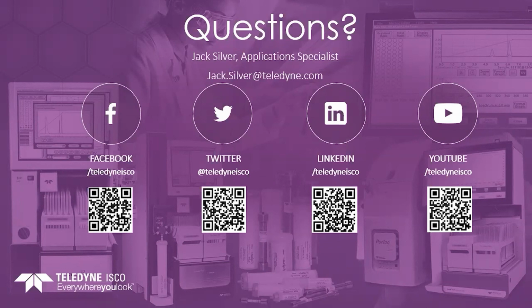Another question, and I thank you for keeping them coming in, is what is the minimum amount of sample that you can run on a scouting gradient on the focus gradient generator? Usually for a 20 by 150 millimeter column, I tend to run about 1 or 2 milligrams if the compound has a decent UV absorbance. If the compound is very impure and there's lots of peaks, I might have to inject a little bit more.